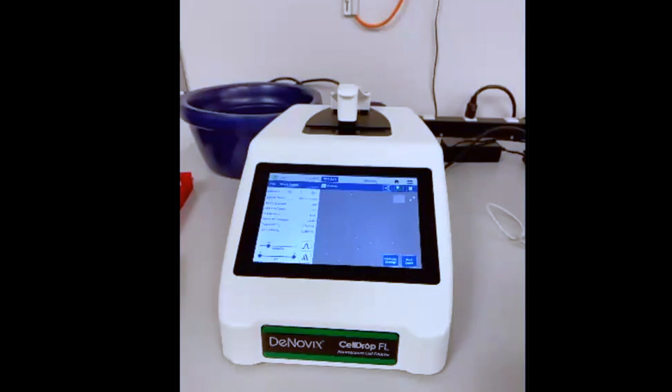So the question is, can we use a disposable slide in this for contagious samples? Let me demonstrate this. Let me go back into screen share here.